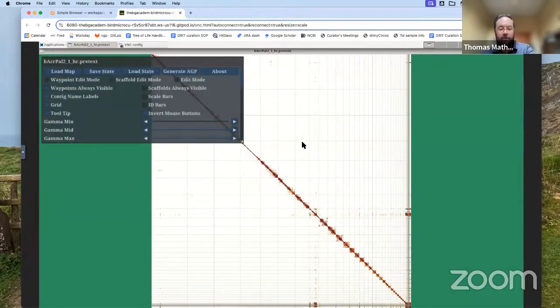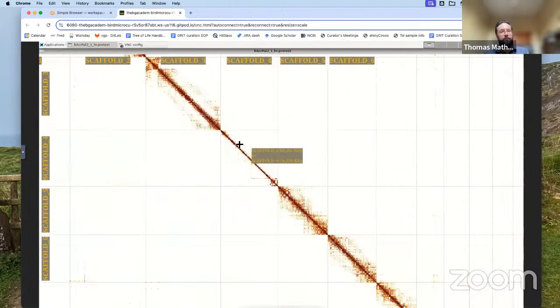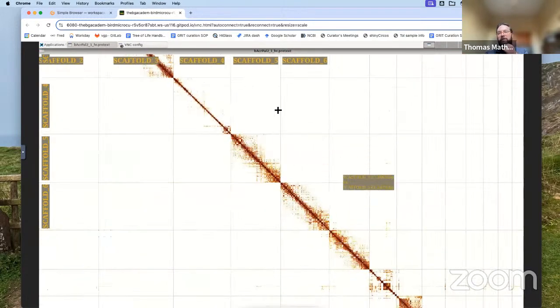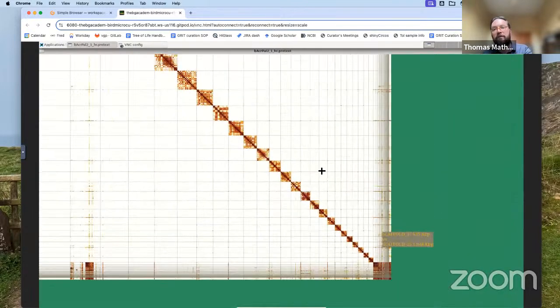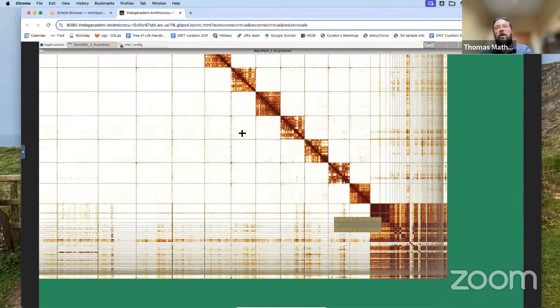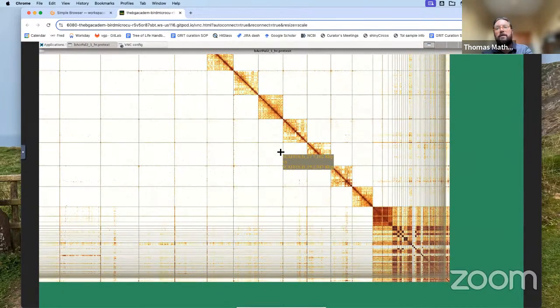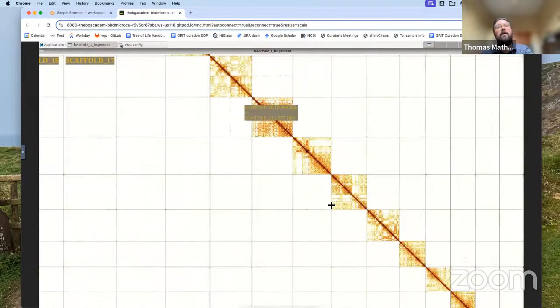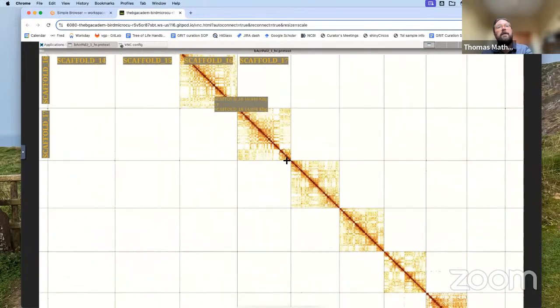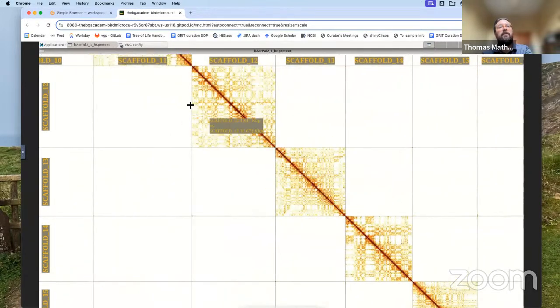Okay. So this was one that we curated at Sanger recently. It's very contiguous. But what's striking, so there's a lot less travel, but we could actually find, so I've just adjusted the contrast here so you can see it better. So there's various chromosomes here, but if you look here, what's happened in this assembly is there's one scaffold up here. I'm just trying to find it for you.